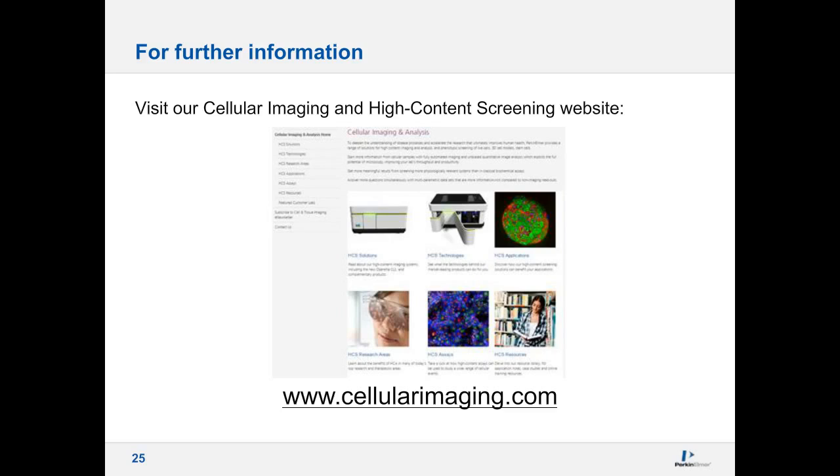Yeah, let me take that one, Christy. So I'm not 100% clear to what imaging mode this question relates. If the question relates to fluorescence imaging, then we obviously have emission filters in place to adjust the camera settings there and filter the emission light.